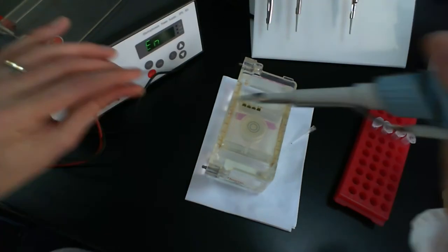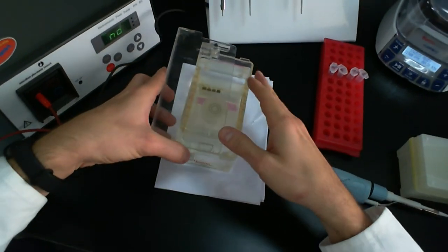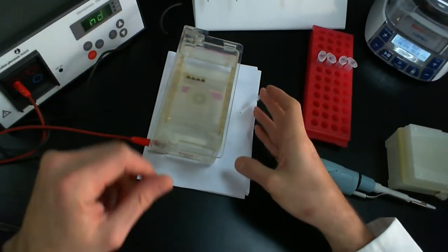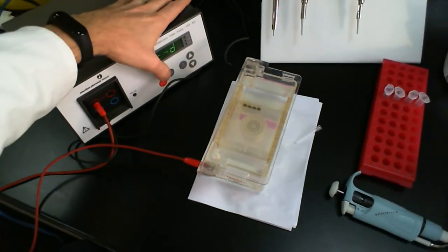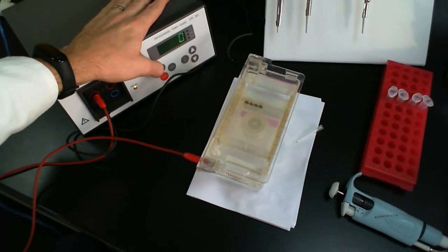Okay, so I'm just going to show you one more thing really quickly before I finish this video. I'm going to close this up. Whenever you're doing electrophoresis, before you leave, always check to make sure it's actually running. So there's a power supply right there. I'm going to turn it on, so I'm going to set it to 100 volts and hit run.